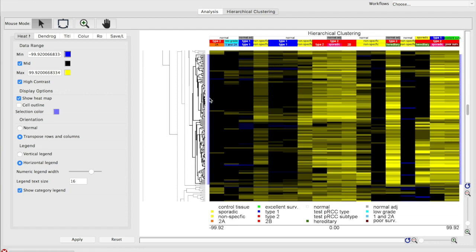Once we had selected these genes, we then made a list of them using Partek Genomic Suite, and then copied and pasted them into the networking platform String, which is a free product, and Pathway Studios, which is a commercial product for bioinformatics analysis.